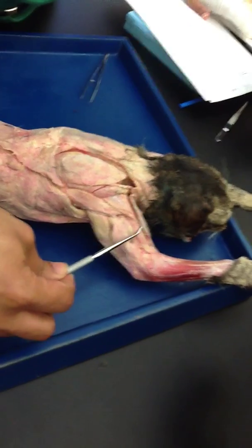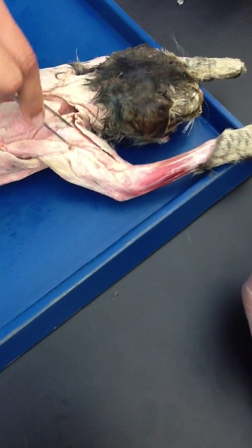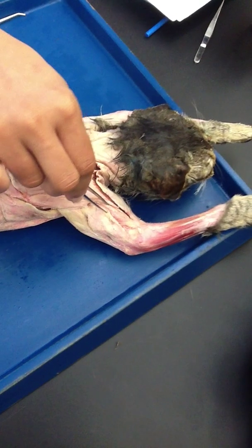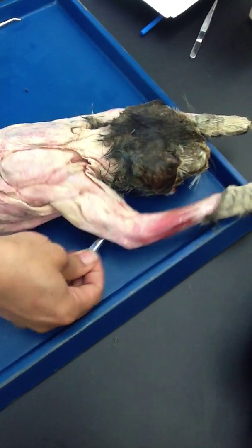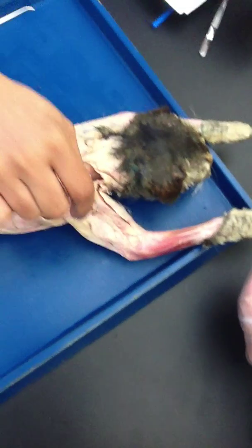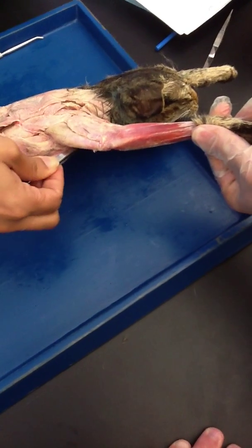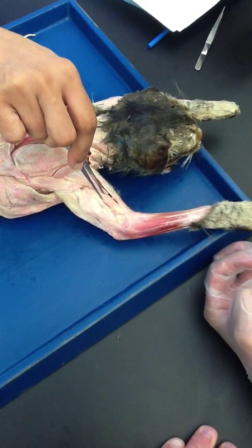Now this muscle right here — which is right in front of the acromiodeltoid — this is your brachialis. Brachialis is present on the posterior side of the arm. The anterior side is where you are going to find biceps. A lot of times students mess this up and call this biceps, but biceps is not on this side. The posterior is the brachialis. On the inner side, this is where the biceps is for the cat.